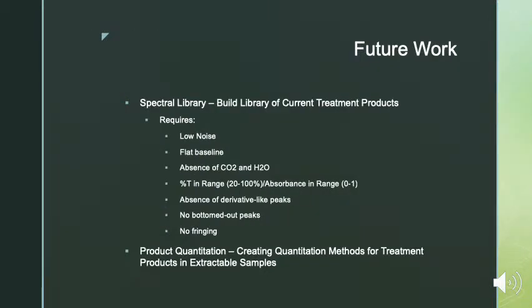But there are still some areas where our spectral characterization can be improved. Now, at a sample prep level, we're looking into investing in a mechanical grinder and a sieve in order to more uniformly grind our samples into powder and make sure we get a more uniform contact with our IRE, compared to just grinding them in a mortar and pestle by hand, which could result in non-uniformities.